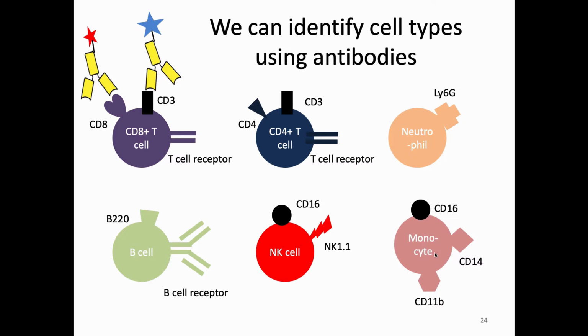As you can see here, I would generally want to have antibodies that had some sort of detection tag, like a red star or a blue star. And so I would look for the cells that had both reds and blues. If I found blue alone, that might be a CD4 T cell, for example. And so I would just do that type of detection.